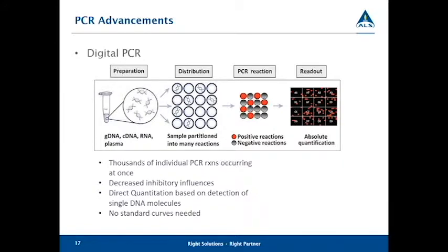Another twist on the PCR technologies is digital PCR. And really, it's just miniaturization of the PCR reaction. Your PCR mix is separated into many, many different small reaction wells, and they are run all at once. Now, I have very little life experience with this technology, but the claim is that by decreasing the volume of the reaction, you actually reduce the inhibition on the Taq and allow more efficient amplification.